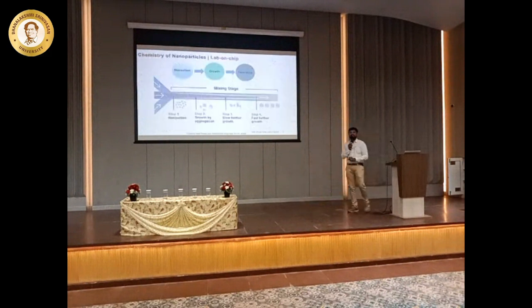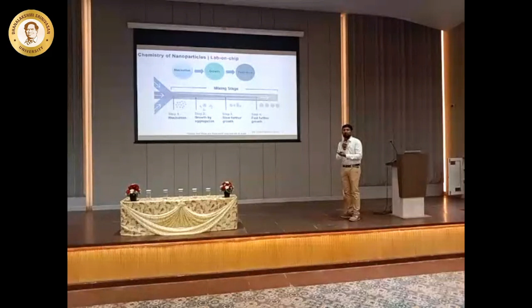So as I said, we have all these bigger instruments coming into the picture. Now I'm going to use very few, very low cost equipments that can eventually make my nanoparticles at specific structures. Say for instance, I said nucleation, growth and formation is my idea, right? I'm going to make metal nanoparticles or metal oxide. So what is happening is I'm going to flow whatever precursors I'm going to add.